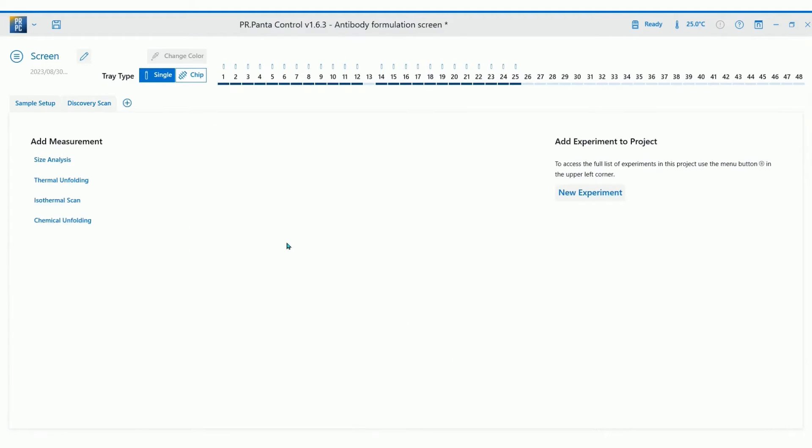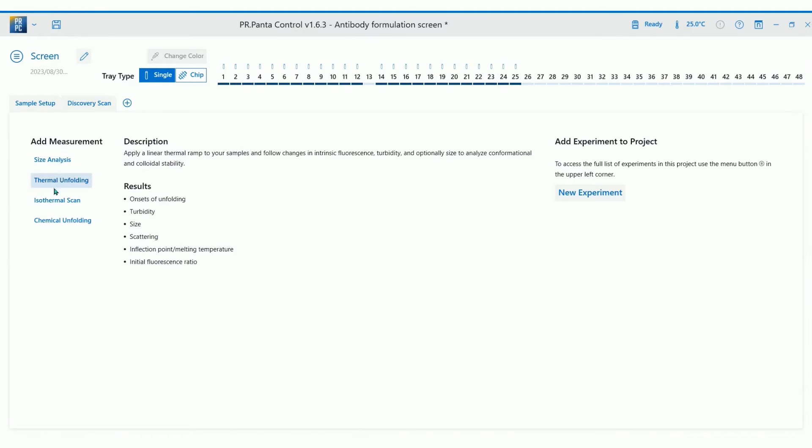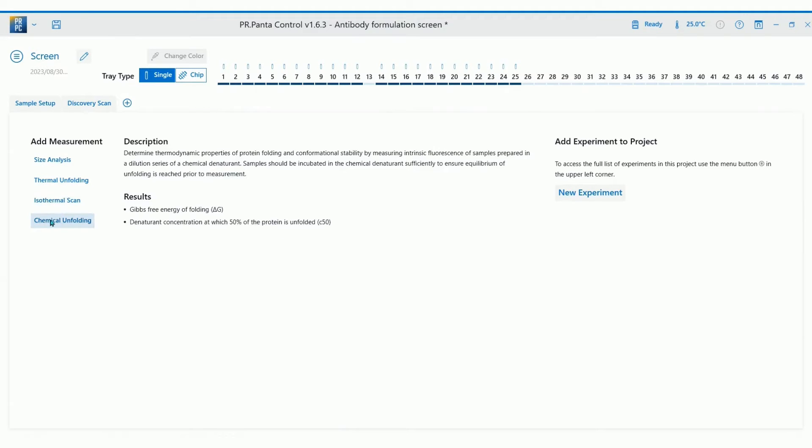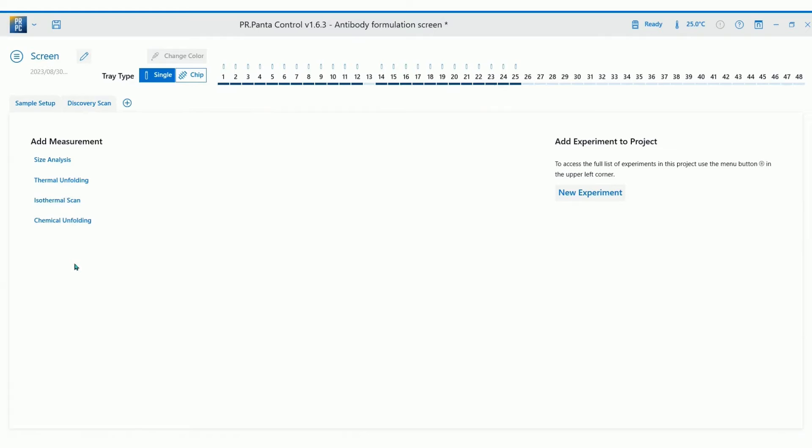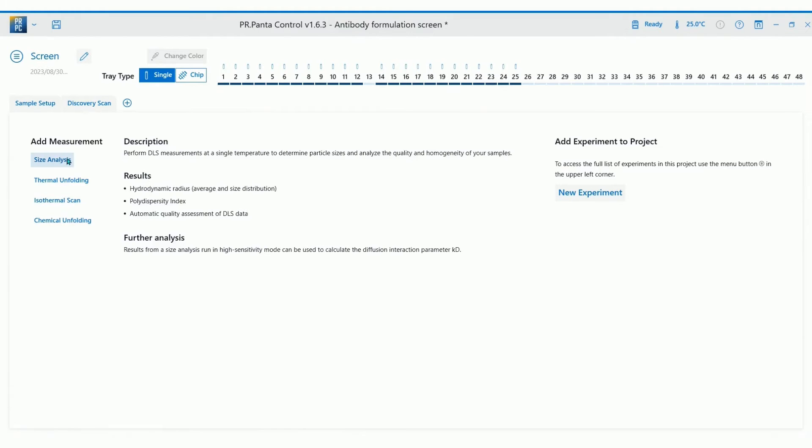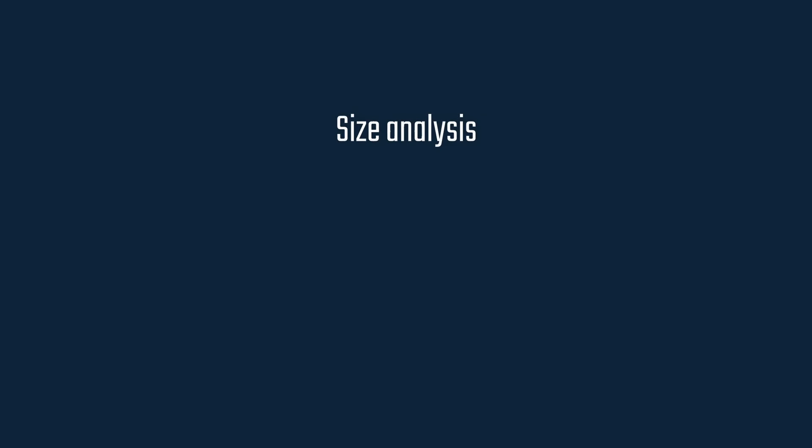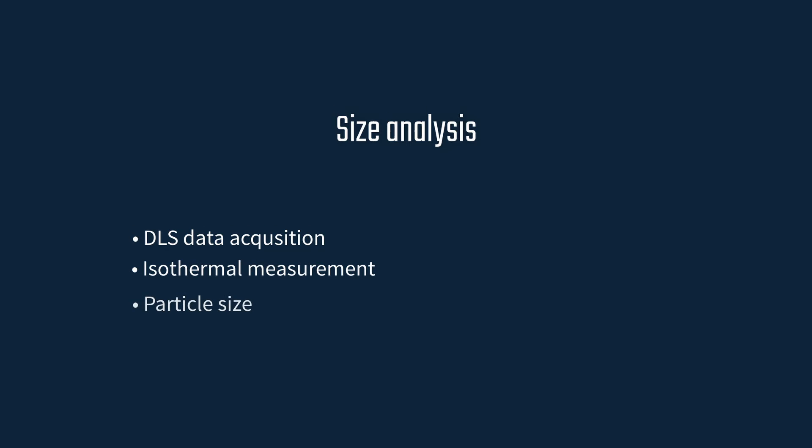You will see a list of all possible measurement options with their description. For this demonstration we will focus on size analysis and thermal denaturation. First, let's start a size analysis experiment. This experiment takes a DLS measurement at a single temperature to determine particle size and assess sample homogeneity.